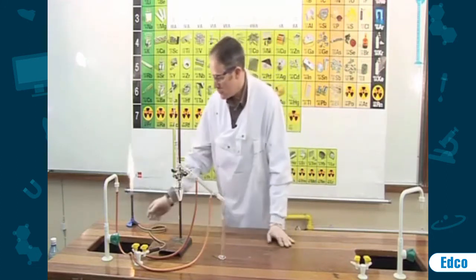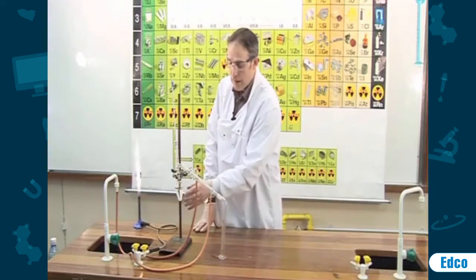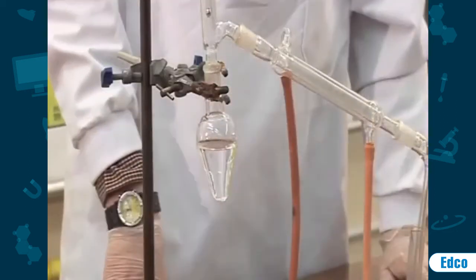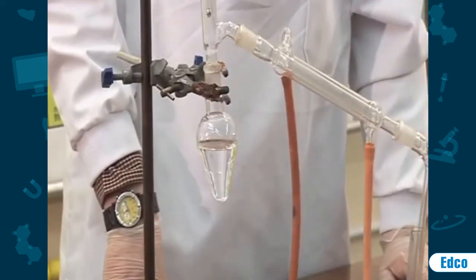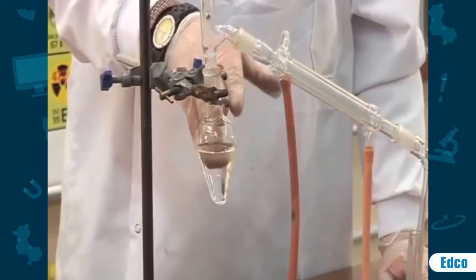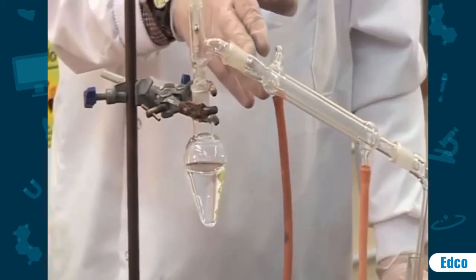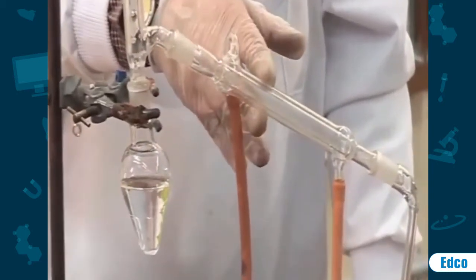What we are going to do is heat the flask, and the alcohol will boil at 78 to 80 degrees. The alcohol will change state from a liquid to a gas and will travel up the tubing and down through this pipe here, which is known as a condenser.